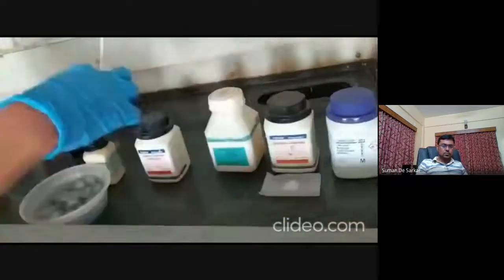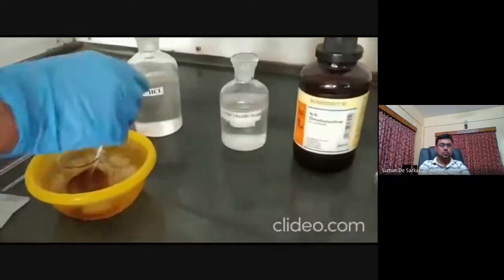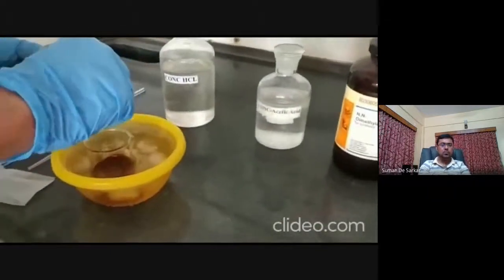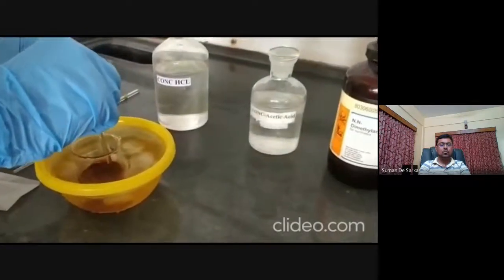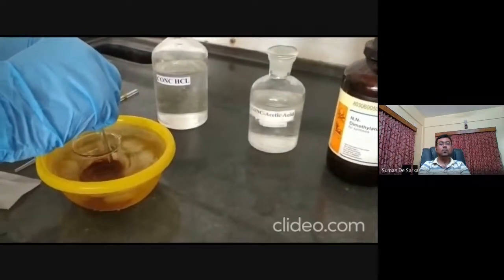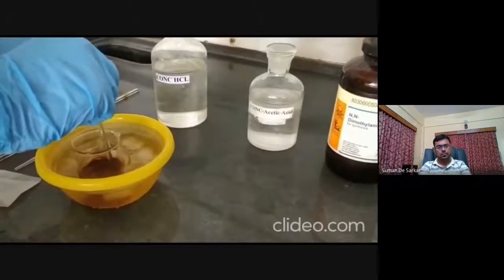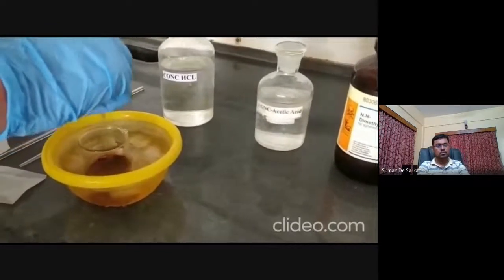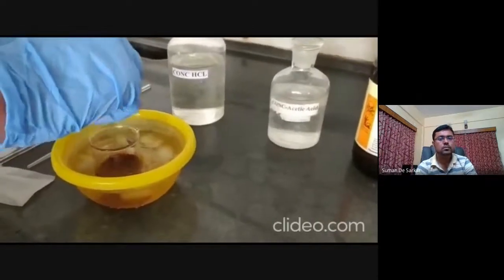Now we are making the solution alkaline. So you see the methyl orange is red in color in acidic solution. And now we are adding 5% sodium hydroxide solution and making this reaction mixture alkaline.